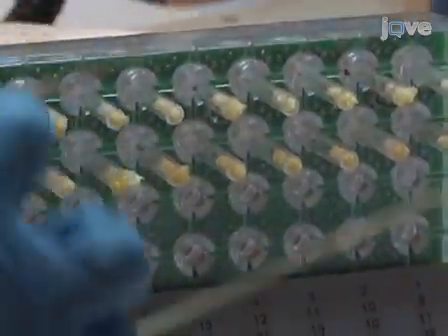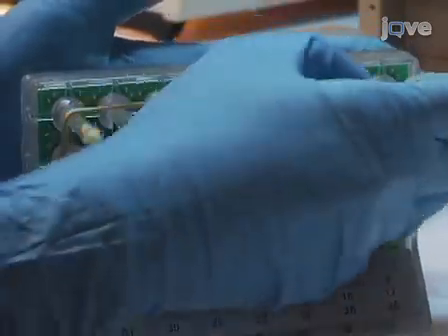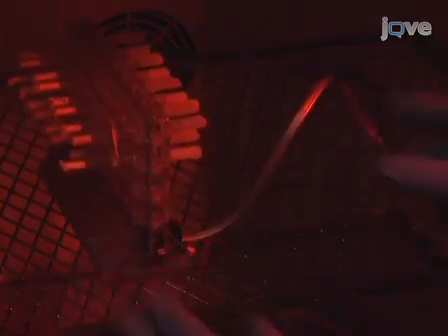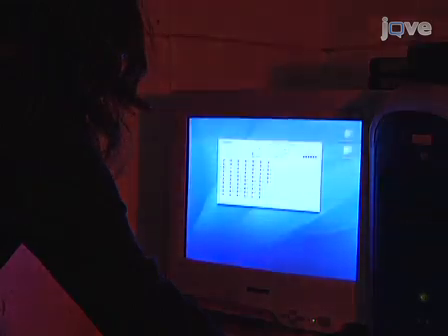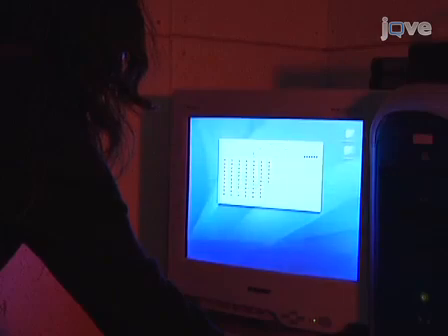With the newer, more compact model of the Trikinetics monitors, it is necessary to hold the tubes in place with rubber bands to ensure that the infrared beam passes the tube at the center position. Finally, put the activity monitors into the incubators and hook them up to the data collection system via the telephone wires. Check using the DAM system collection software that all the monitors are hooked up properly and that data is being collected from each of them.